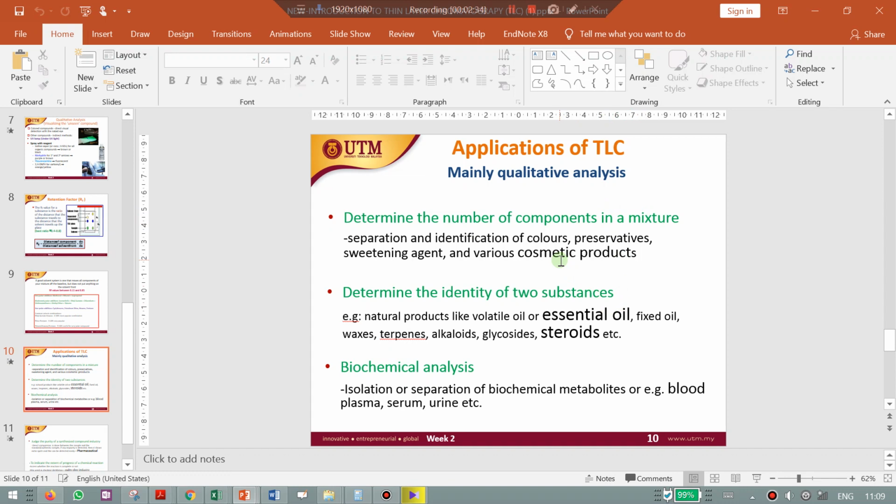You know that company B's pen has 5 spots, so your idea is to produce the pen for your company with also 5 different mixtures. That's one of the examples, contohnya lah. You want to do reverse engineering.